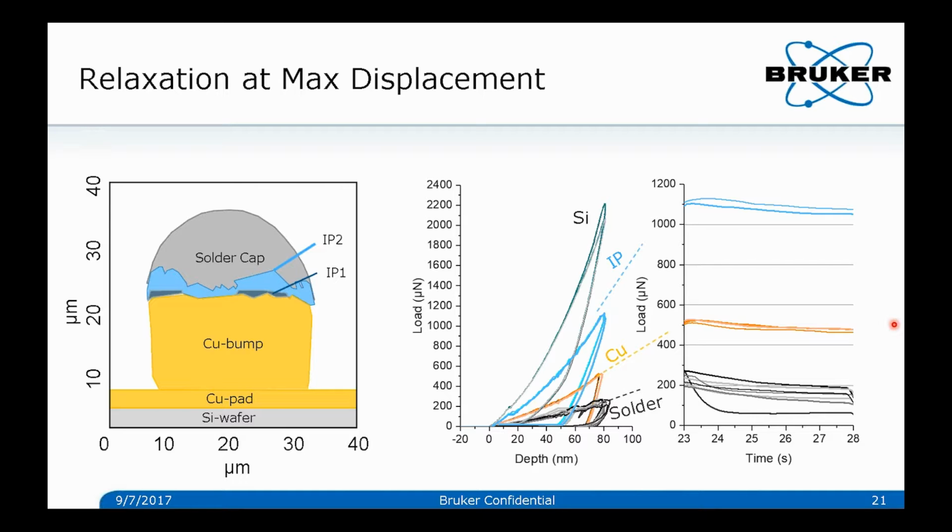So you can fit this to different models. You can extract time constants for the stress relaxation behavior. You can also do the opposite, which is hold the force and measure creep properties.